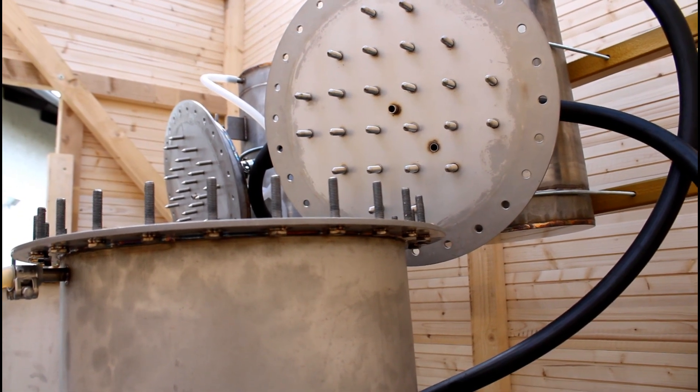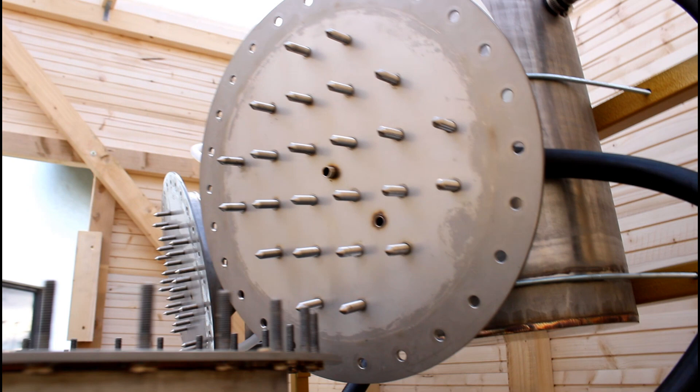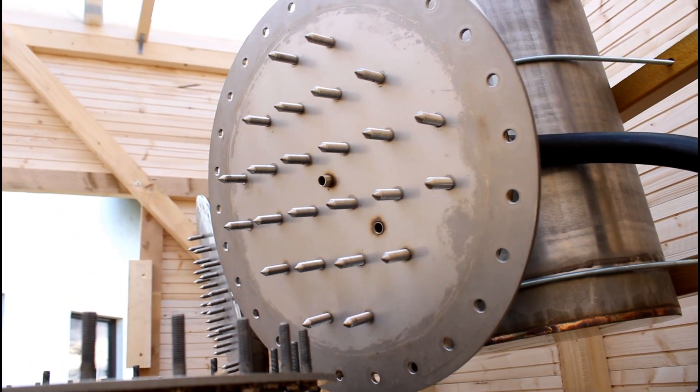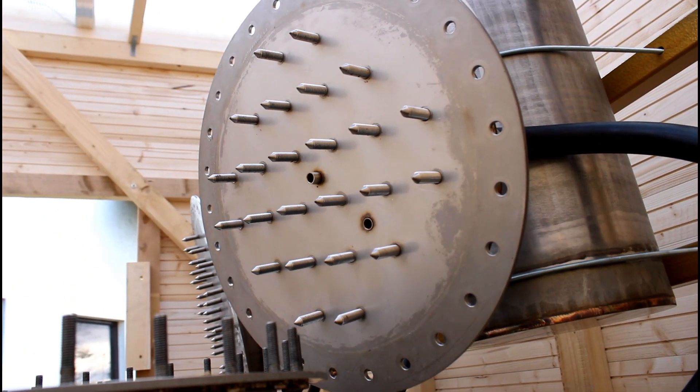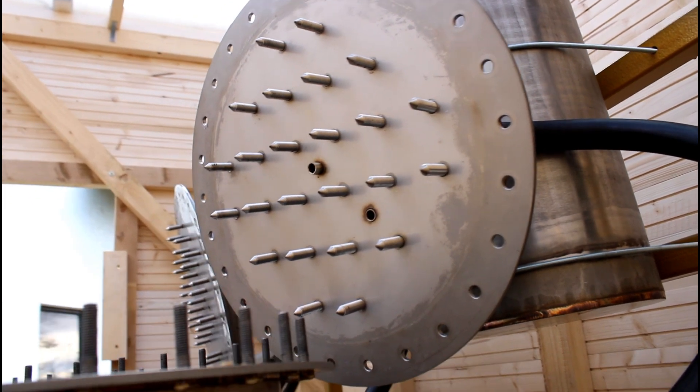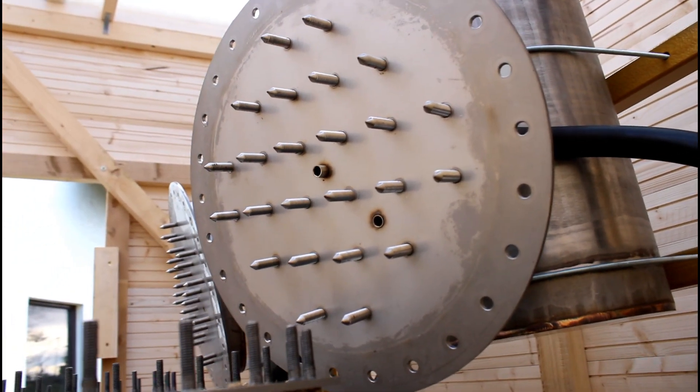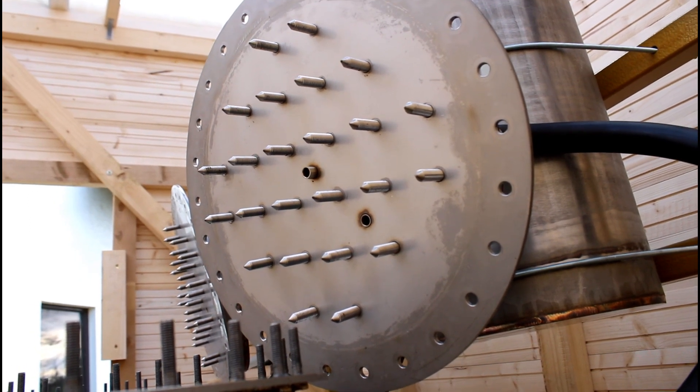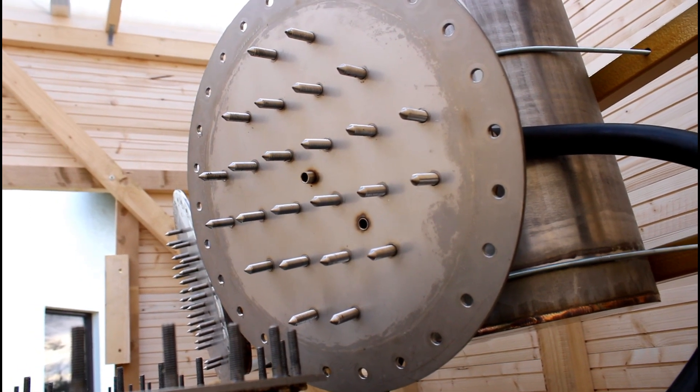But here you can see now the lid. You see that there are many spikes on the lid. And this is the case because there the vapor will condense and drop onto the herb.